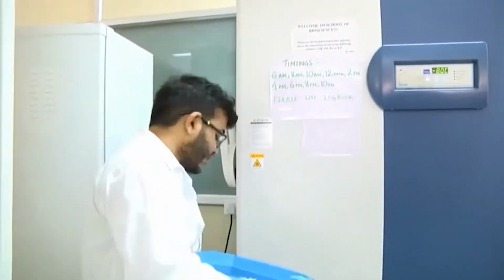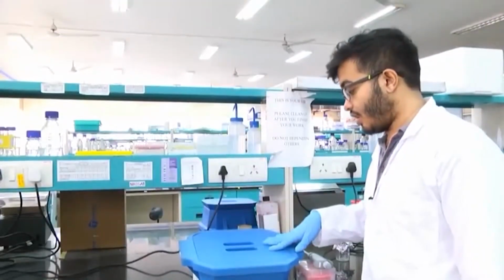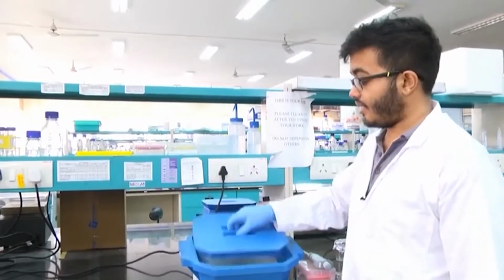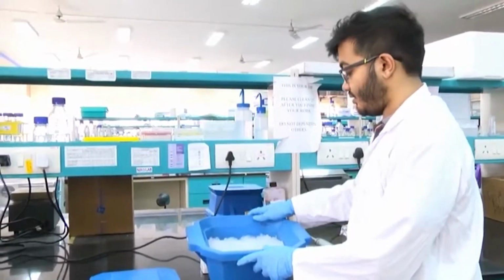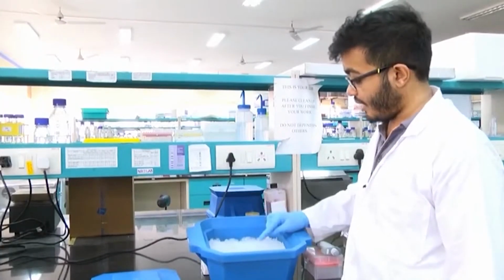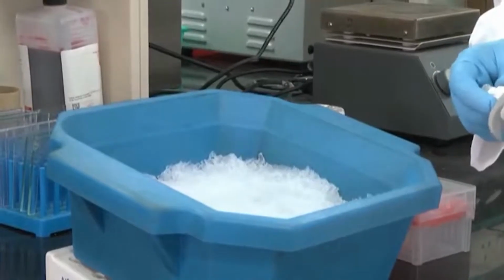So, what we are going to do next is add the DNA to the competent cell, which you will be seeing subsequently. So, we have taken out our chemically competent DH5 alpha E. coli cells and we have kept them in ice, and along with that we also have our ligation product also in ice. So, what I am going to do now is I will take 1 microliter of our ligation product and add it to our competent DH5 alpha cells.